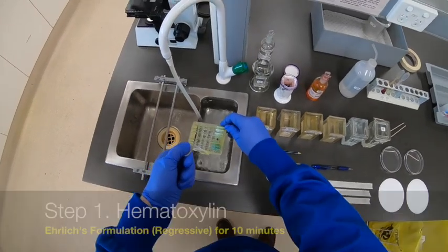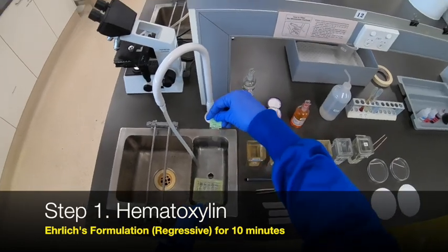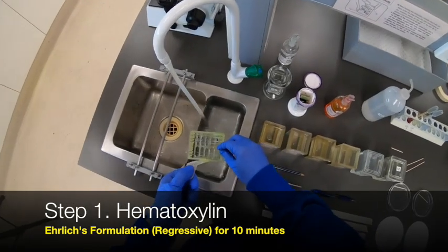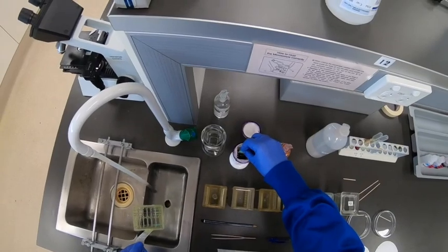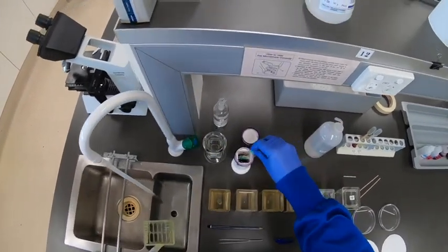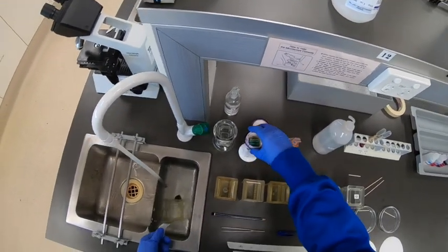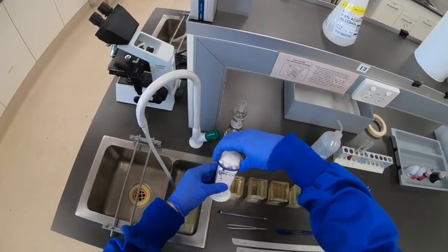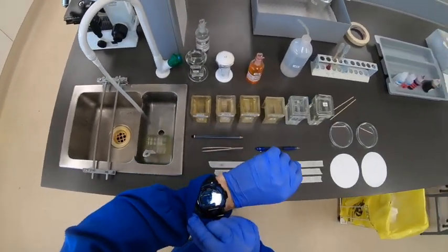Welcome to this demonstration of the H&E stain. The first step, after taking those slides down to water, is to shake off the water and place each of the slides into the Coplin jar containing Ehrlich's hematoxylin. This is a regressive formulation of hematoxylin, which means we will be initially overstaining those slides and then through a differentiation step we'll bring the level of staining back to the desired level.